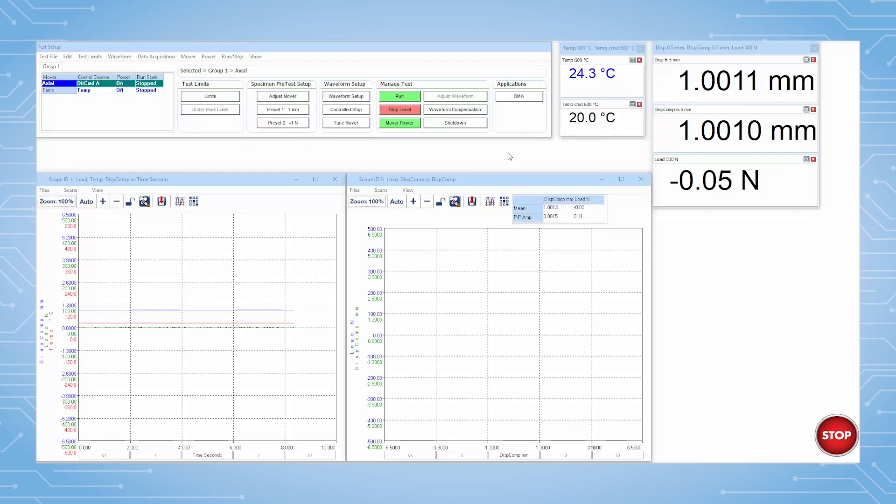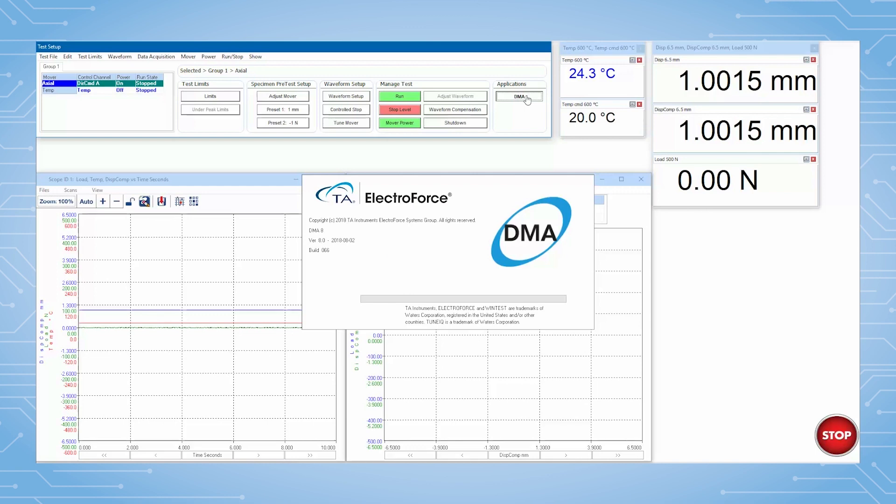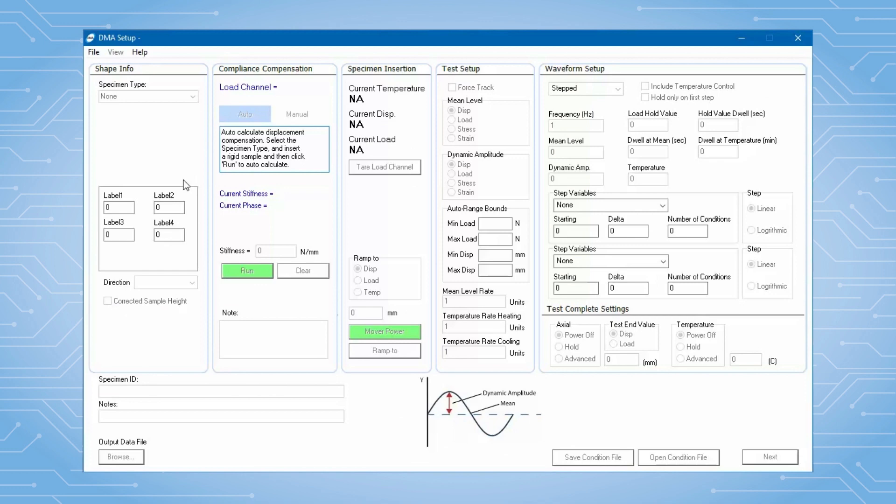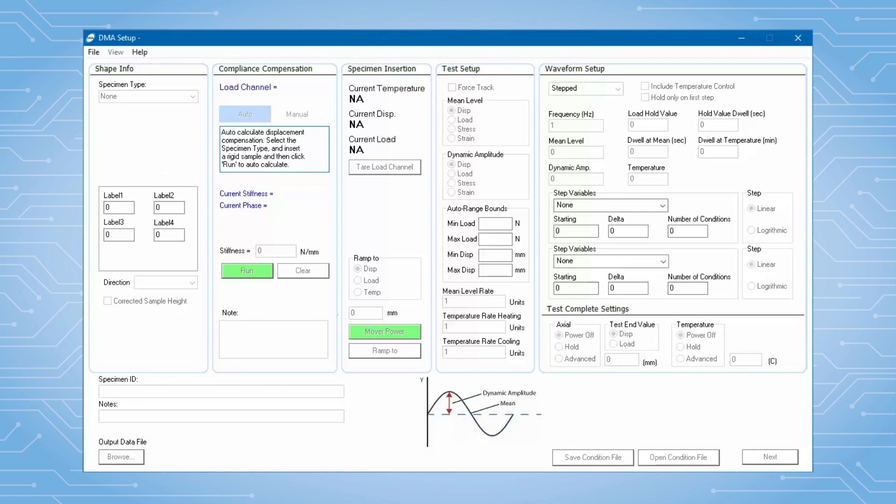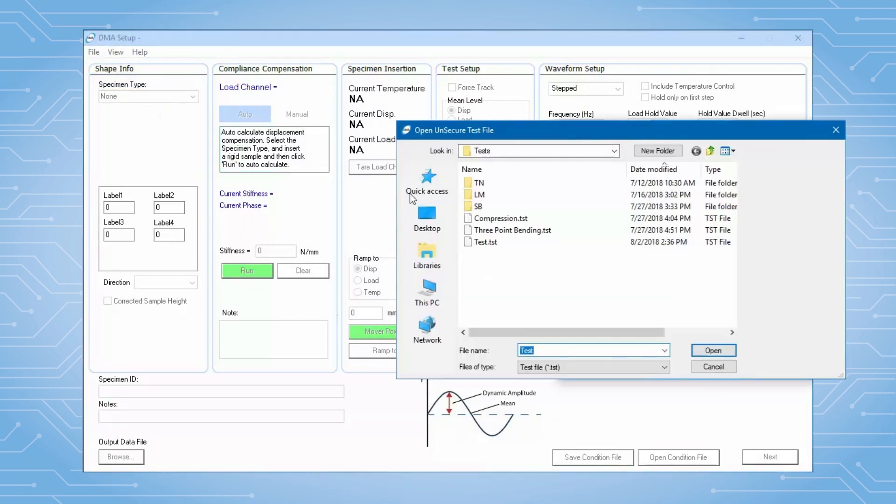Within the WinTest software, I initiate DMA from this application shortcut button. This opens the DMA application and minimizes WinTest. I open a test file to restore any settings I previously saved.